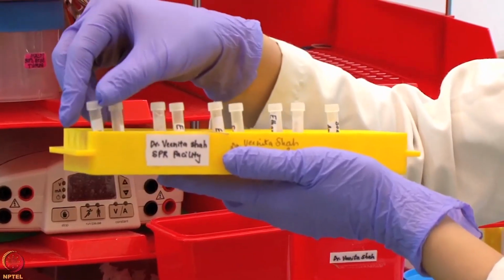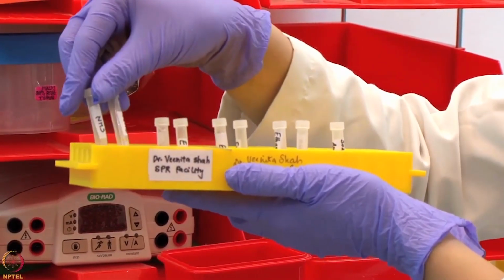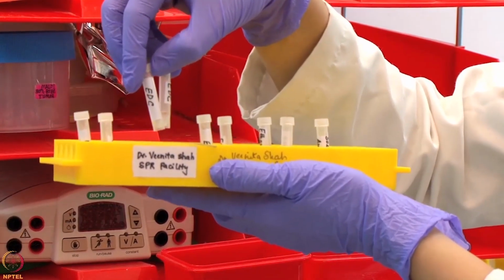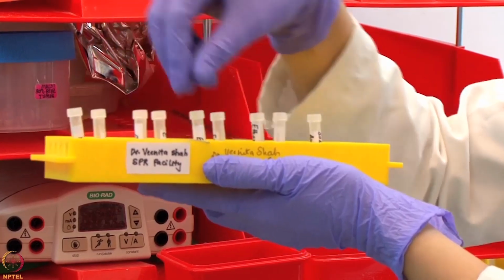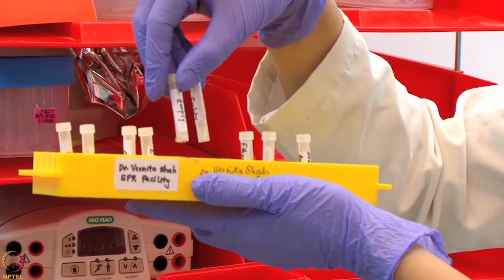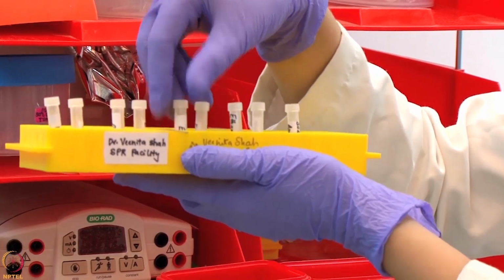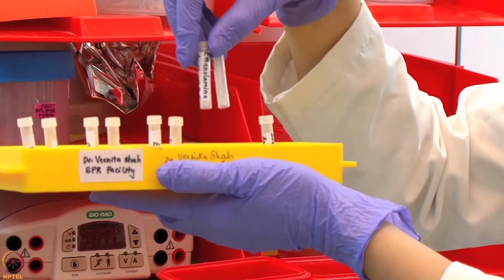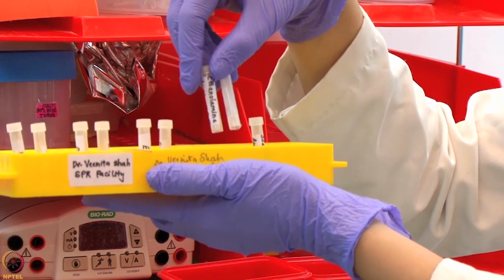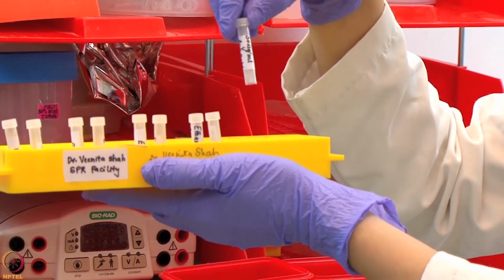We have now transferred all the reagents into these specialized tubes. So we have 2 NHS tubes, 2 EDC, 2 empty tubes for longer stability of EDC NHS, which will be mixed inside the system, 2 ethanolamine tubes, one for the blank flow cell and the other for the active flow channel, and 1 ligand solution.